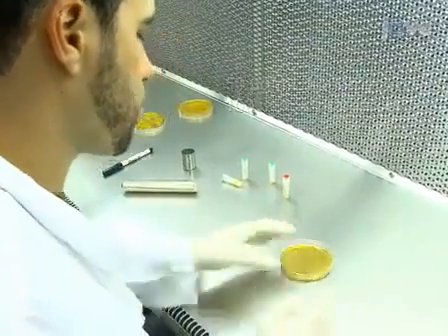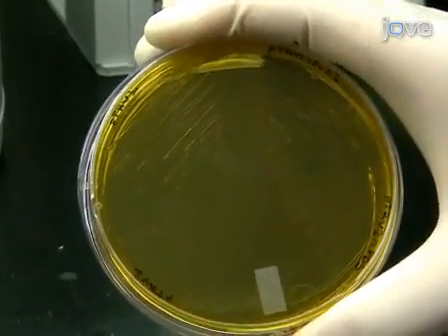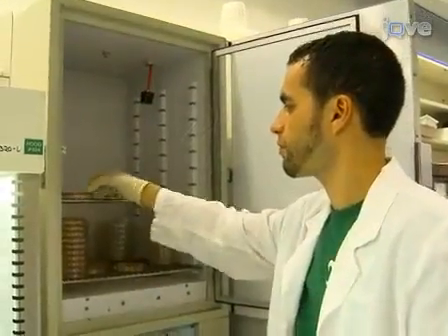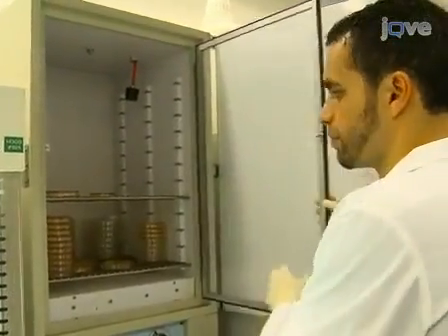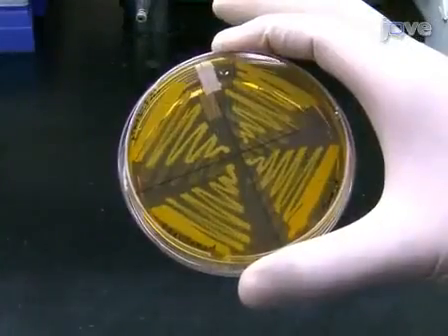Kanamycin selects for the PTRV plasmid, while rifampicin selects for the Agrobacterium. Incubate the plates at 30 degrees Celsius for two days, until bacterial colonies have grown on the LB plates.